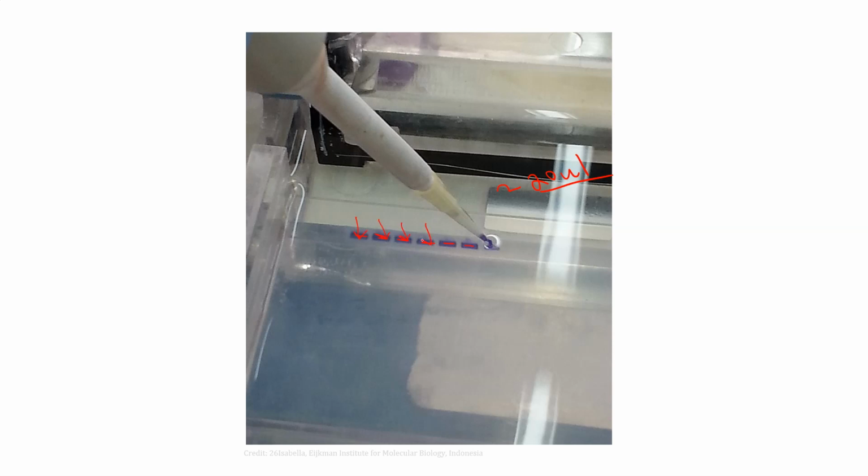Once all the DNA is loaded up, keep in mind that the DNA added at this point has likely undergone the polymerase chain reaction, so there's a lot of whatever particular DNA we're interested in evaluating, and it's also been digested, so it's been cut with restriction enzymes already. So this is amplified DNA that has been cut with restriction enzymes, so the fragments of DNA that are going to be present are already present.